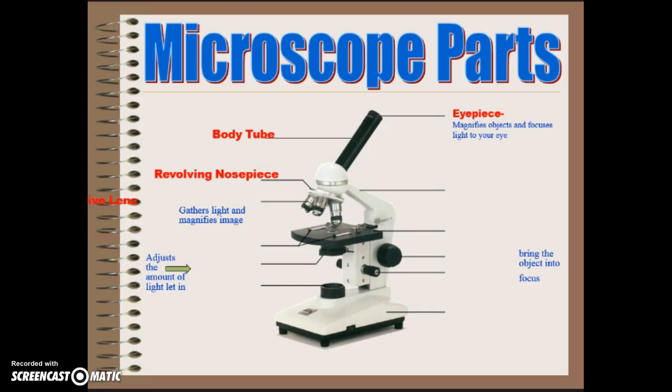Speaking of objective lenses, our microscopes in our classroom have 3 of them. They are what gather light from the stage and magnify the image to go into the microscope through the body tube to your eye for you to see. Our 3 magnifications are 4x, 10x, and 40x. Some microscopes have 100x magnification.